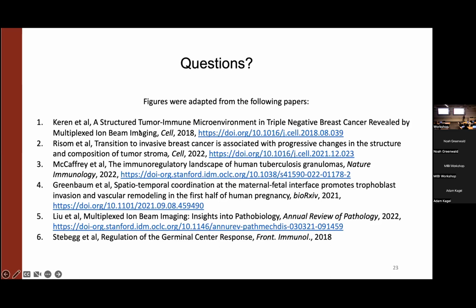And I've actually tried to decrease and increase it. I think the short answer is, if you think it makes sense, run it with several thresholds, because when you go to a lower threshold, you might pick up on more delicate trends that you just did not see when you were looking at a larger distance around whatever it is that you're looking at. But for the most part, it will be robust around the 100 pixels limit. Does that answer the question? Yeah. Okay.